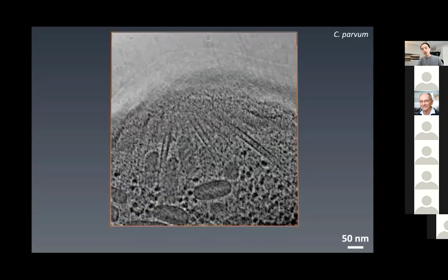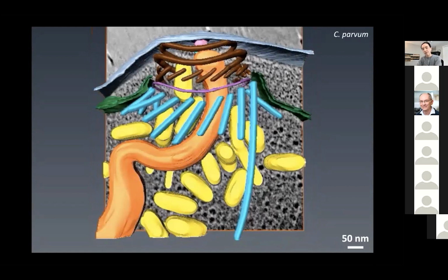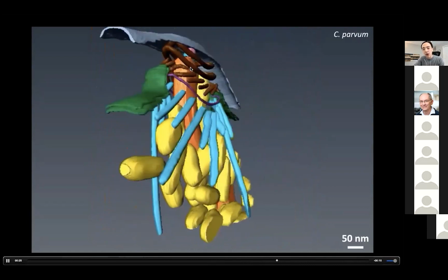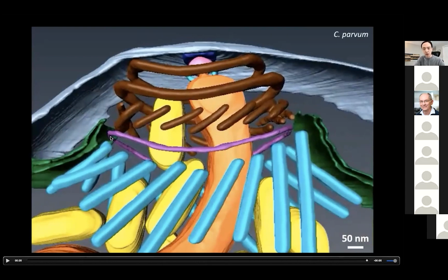So slice by slice, while going through these tomograms, right away we can appreciate the high structural complexity of this part of the parasite cells. Through three-dimensional segmentation, we can see exciting features everywhere, including those proteinaceous rings toward the tip of the parasite cell, and those arcs. Those are filamentous structures formed by tubulin named conoid. And this purple ring is another proteinaceous ring called the apical ring, which serves like an organization center of microtubules, called subpellicular microtubules, organized in a helical fashion, going into the cell body underneath the membrane. Together, all those structures form a cage-like enclosure that contains a lot of important organelles and points them toward the apical end of the parasite.